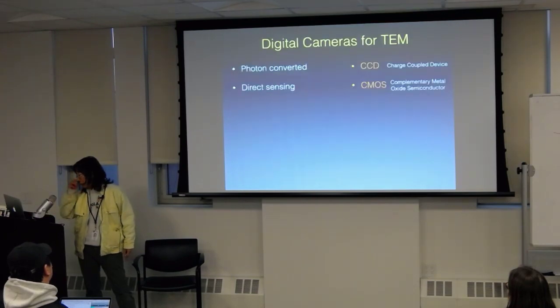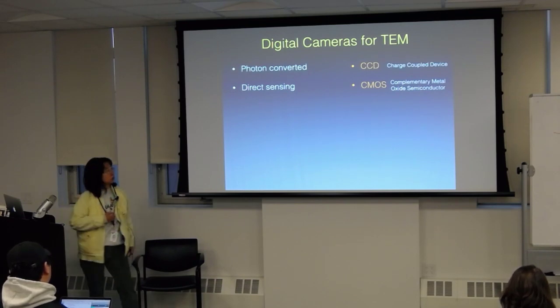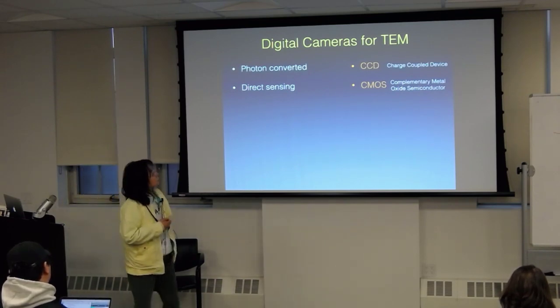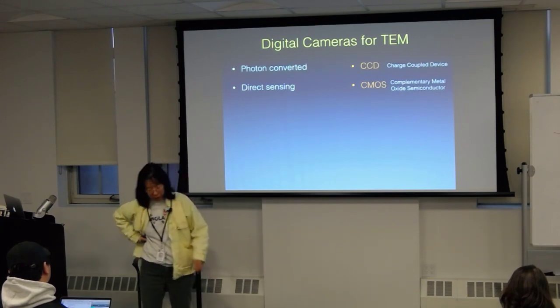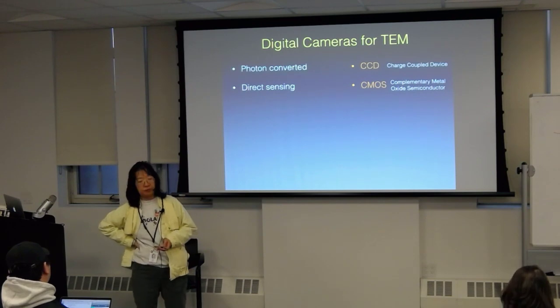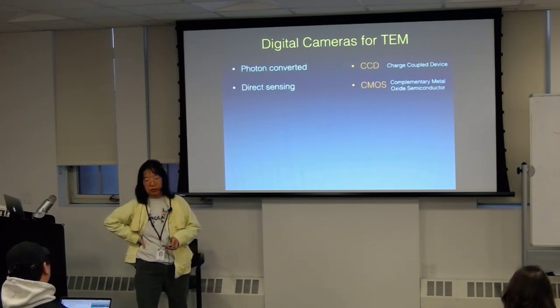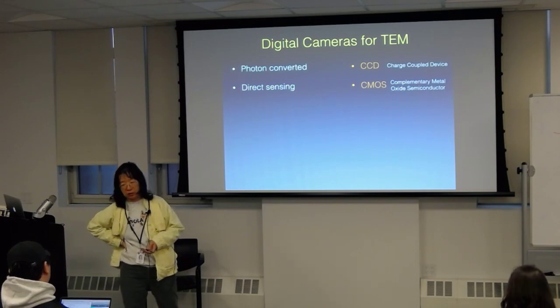Okay. Now, I want to add a little bit about the digital cameras for TEM. Bernard mentioned that there's the CCD and then there's the direct detector. Just to say quickly, all those direct detectors are CMOS cameras.